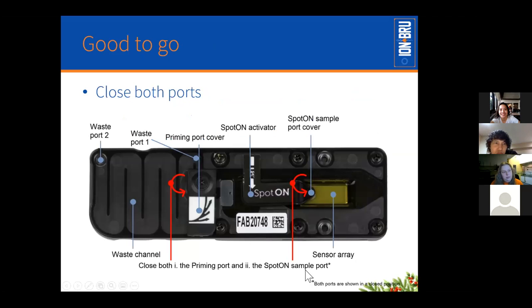So then you're going to close both of your ports again. This one, again, swivels closed this way. This one, you just flip it over and just make sure the little bung goes into the hole there. And then that is you ready to sequence.